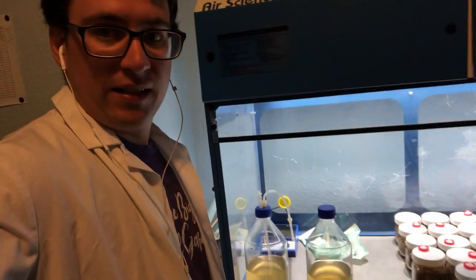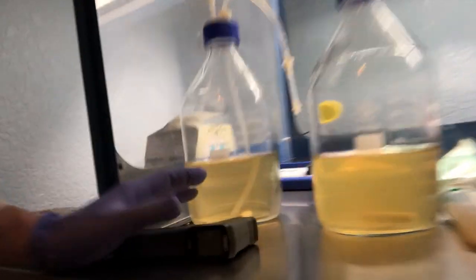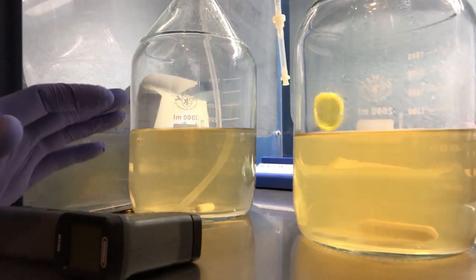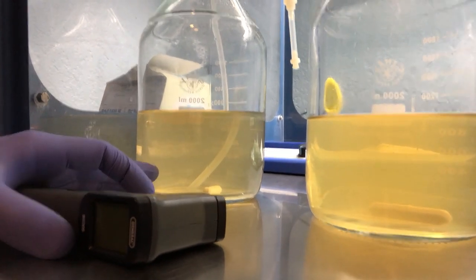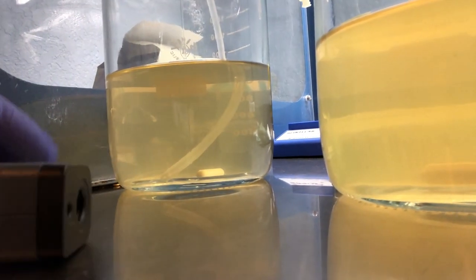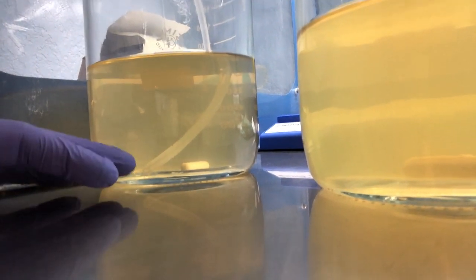The best practice when you're making your liquid cultures is to leave these at room temperature for about 4 or 5 days, and they should remain clear. You can see right now that there's no sediment in here. It's pretty transparent, which is another reason why I like using honey.